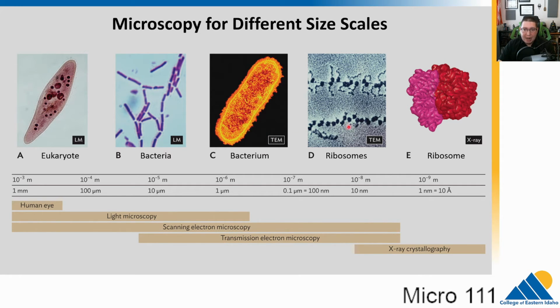And we can even get down into subcellular pieces. So if we looked inside the cell, we could see this is an mRNA here, and these are ribosomes making little chains of proteins coming off of it. So subcellular, inside that cell, we can see with electron microscopy. But at some point, it's too small even for that.